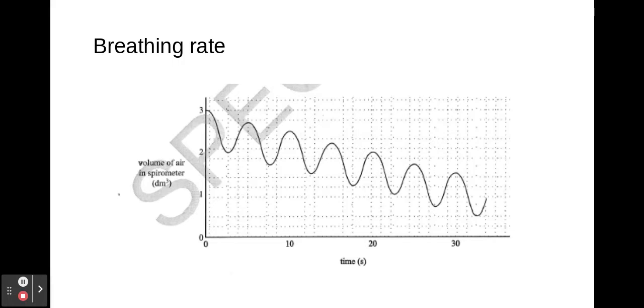Breathing rate in this particular case, I'm counting my number of peaks and troughs. It's really important here that you do one full breath. This one starts at the top, so that would be one. It's important you do one full peak to trough. If I count all those, that's six breaths in 30 seconds, so it's 12 per minute.